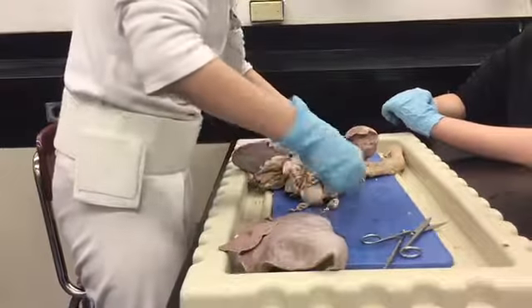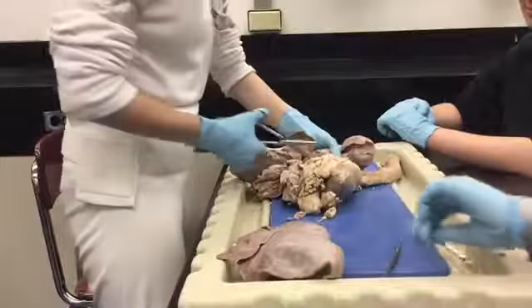It's like when your blood reaches the most, it should be. Oh, wow, cutting the bronchi right here. And then when you use scissors, it's like, so long as your blood is falling. Those scissors suck. I think these ones were our bad scissors.